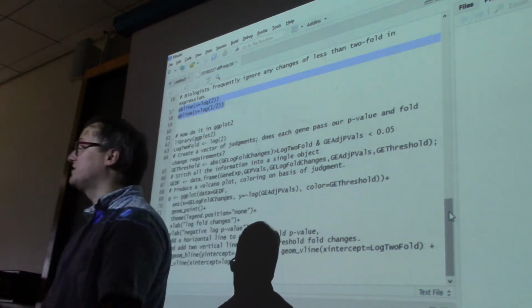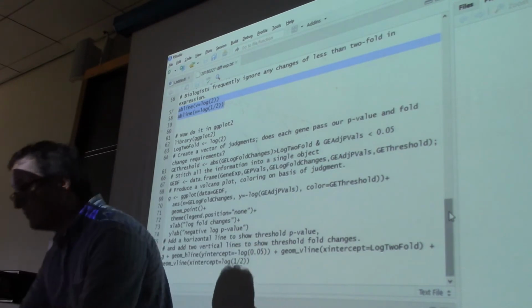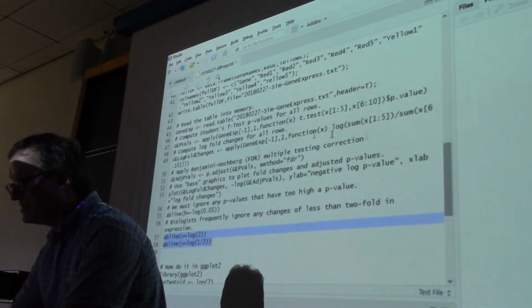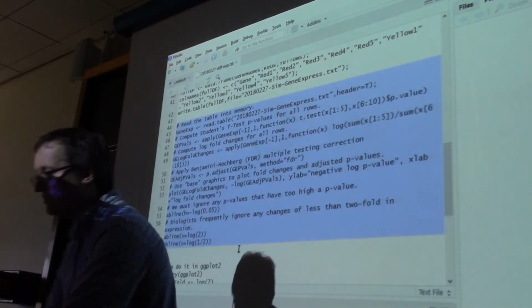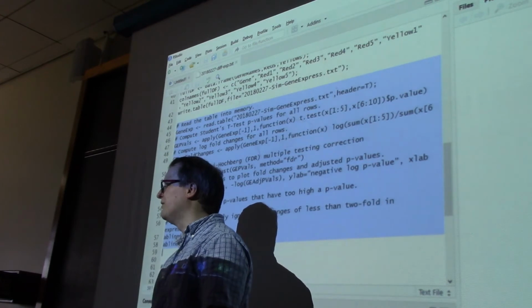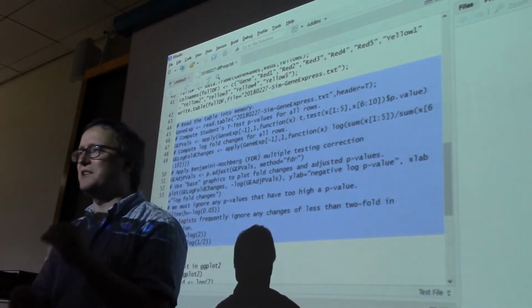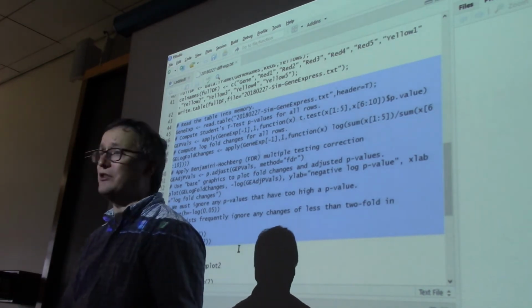Using the apply function is a whole lot more compact, but it's not something I understand very well. So we can see that all of that code, including comments, stretches only 15 lines of code. So you can do an awful lot of work in a very densely packed way if you know your way around the language.